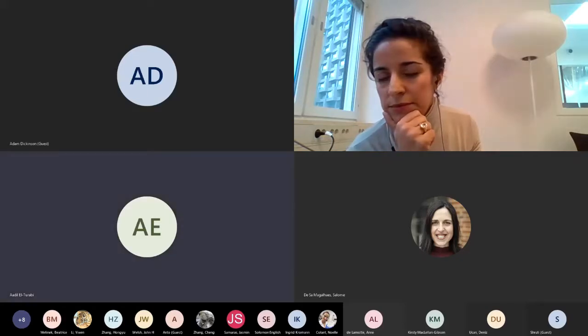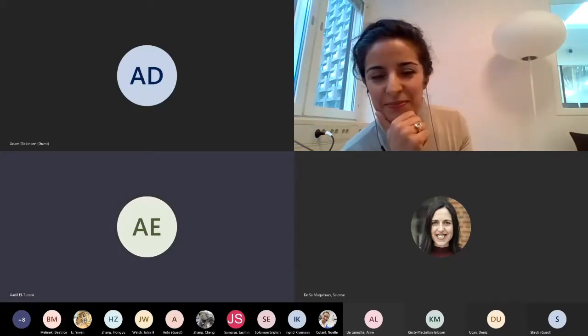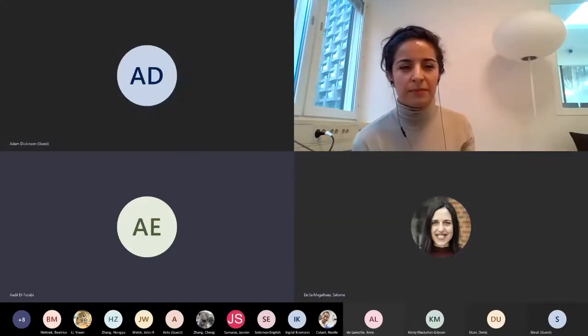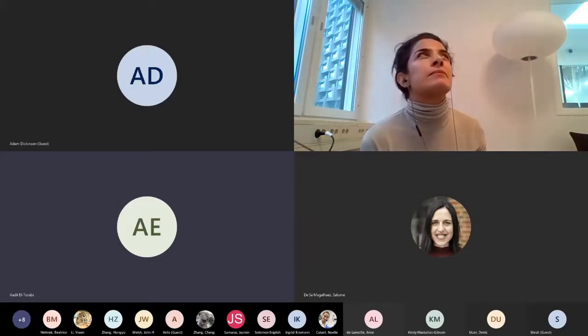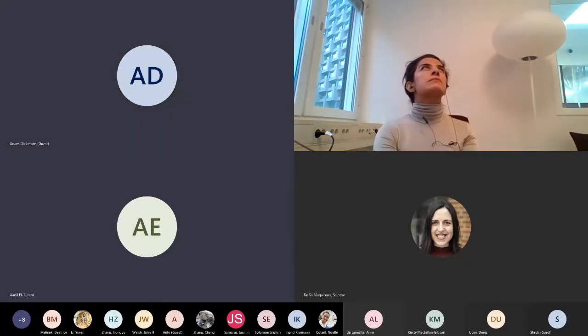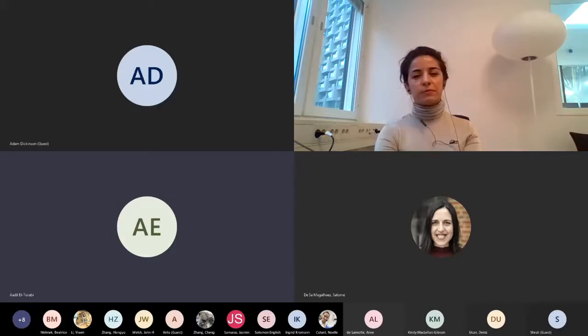Should I follow this up with the other $1 million question? When working with really nice particles, VLPs are really easy to spot, right? You'd think, but sometimes we're working with experimental constructs, and as you said, there's some pleomorphy to it. There's some that looks very much like cell debris. I've had preps where I thought, oh, there's a beautiful looking particle, and it turned out to be maybe membranous vesicle debris or some other kind of aggregate.